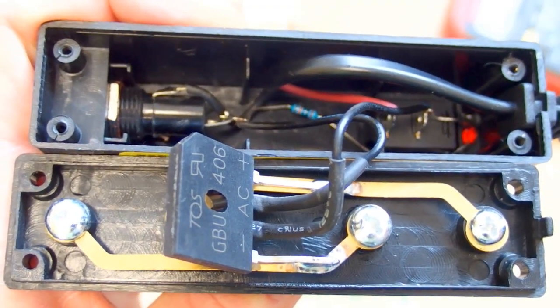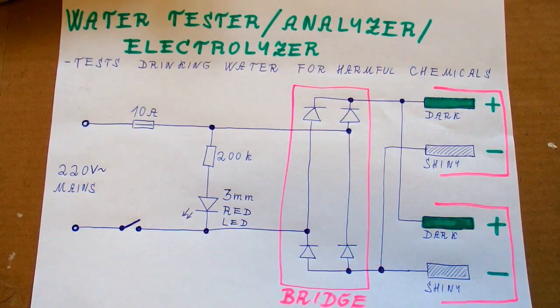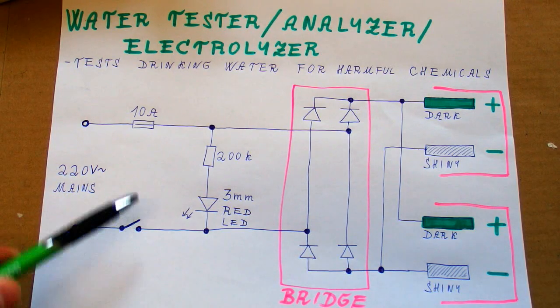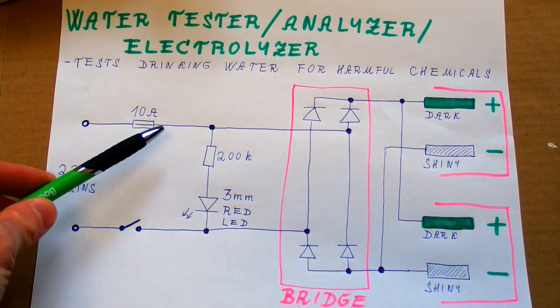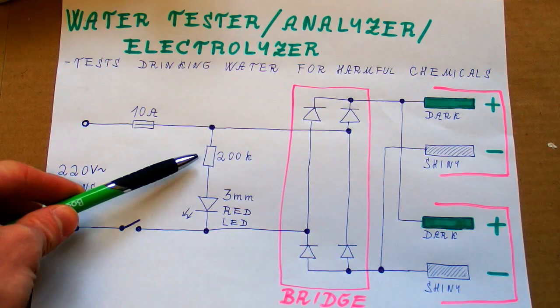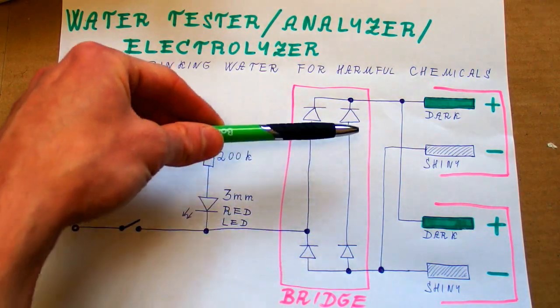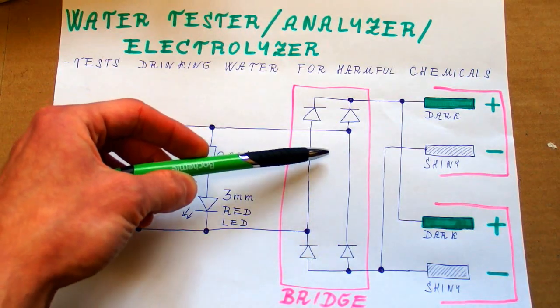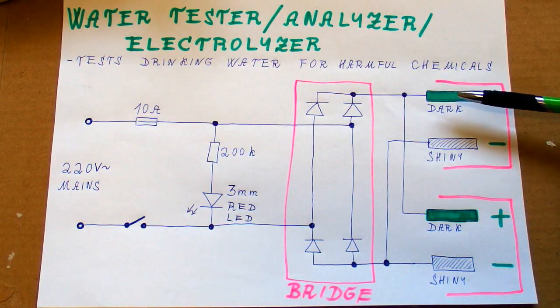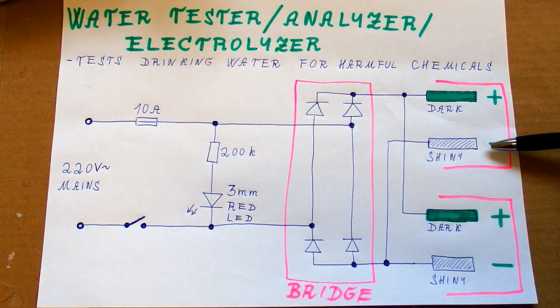It puts the mains voltage directly to the electrodes just through a bridge rectifier, and this is definitely not much safer than using the mains voltage directly. So let's make a schematic because it's definitely not going to be complicated. The mains comes in — one side goes through a switch and the other one goes through a 10 amp fuse. That's actually a lot of current. There's the indication LED with its series resistor and the bridge rectifier. Finally we have the two pairs of electrodes — the darker ones are positive and the shinier ones are negative.